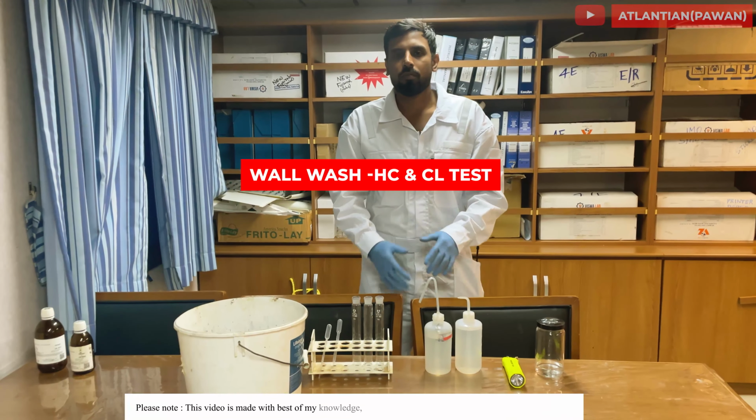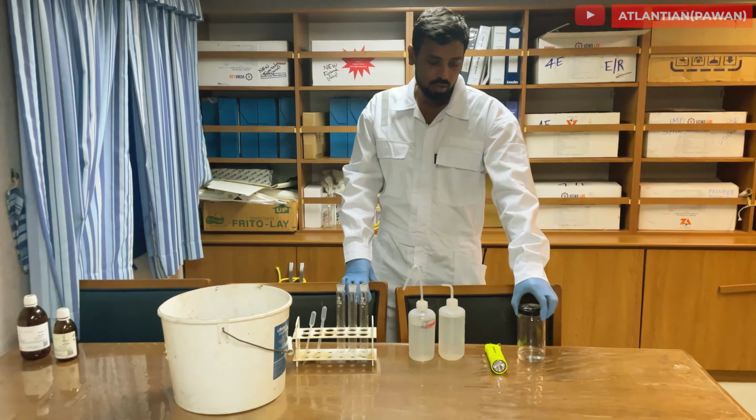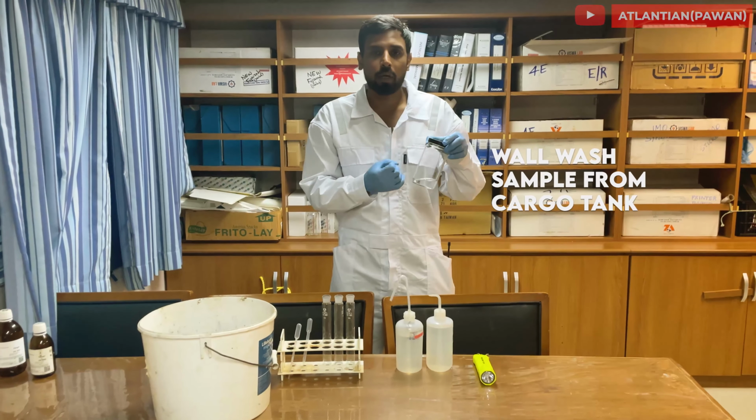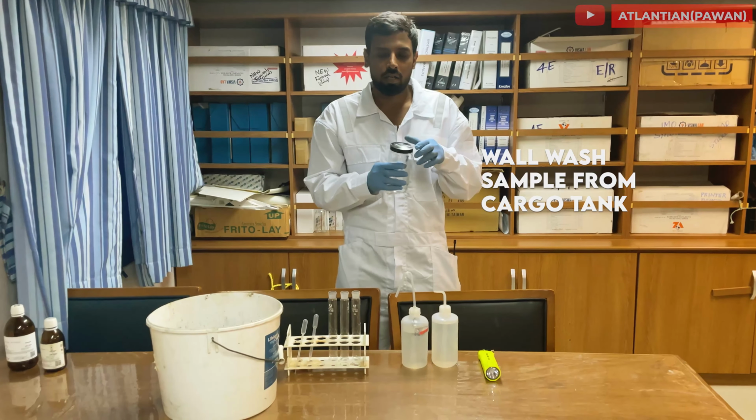So hello guys, welcome. Today we'll see how to do hydrocarbon test with methanol. So first you have to bring a wall wash sample from your tank. So this is my wall wash sample. I've written the tank name also here.